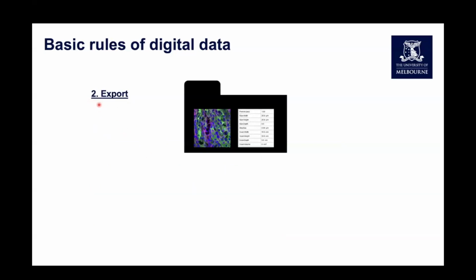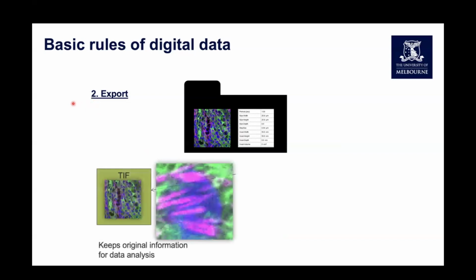After that, we ask that you export your data out. So you should always keep the raw data file as your kind of ground truth. Any modifications you should be doing to exported data, we would suggest that you should do that as a TIFF file. And again, that's because it keeps that raw information.